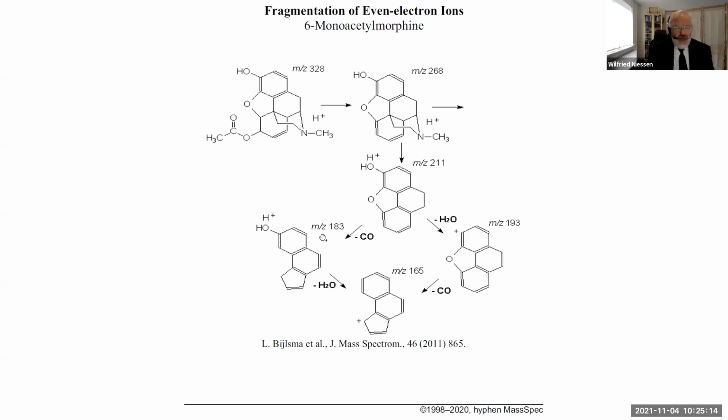My honest answer would be I don't know, because sometimes the ion trap gives beautiful results in that, but sometimes it doesn't work.